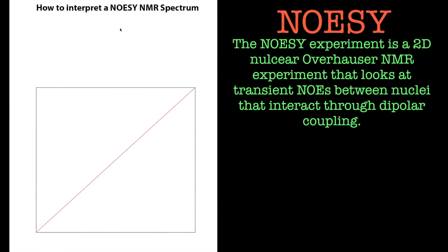Hi, welcome to this tutorial on how to interpret a NOESY NMR spectrum. I'm just going to whisk through this and have a look at this molecule, a tripeptide, and break it down into different colors.